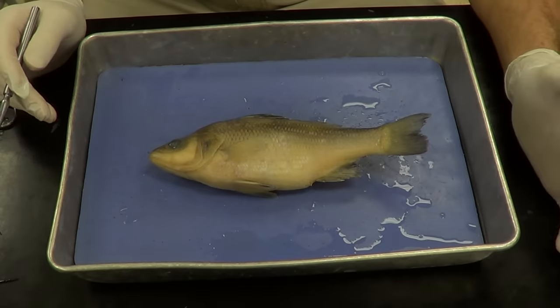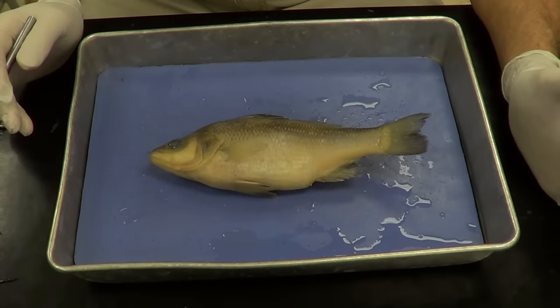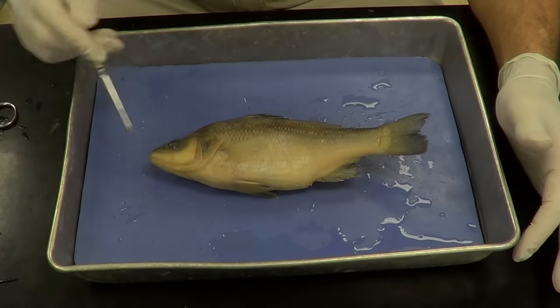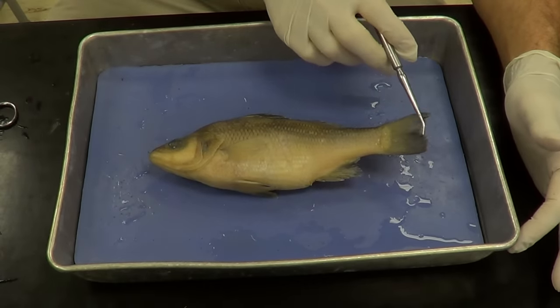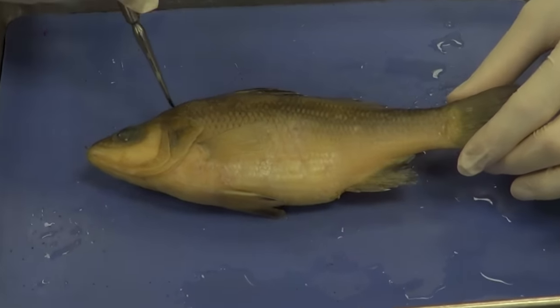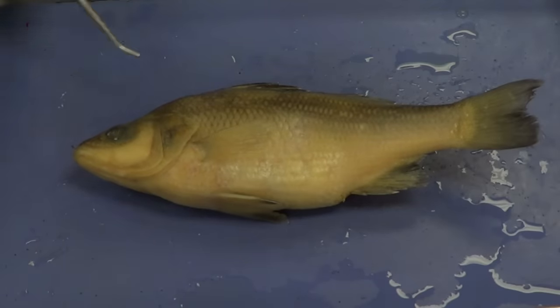Today we're going to be talking about the perch dissection. The first thing we want to do is identify the anatomical landmarks. This is going to be the anterior aspect, and we've got the posterior aspect back here. The belly is going to be ventral and the back is going to be dorsal. With that in mind, let's begin with the anterior aspect and identify some of the external structures.